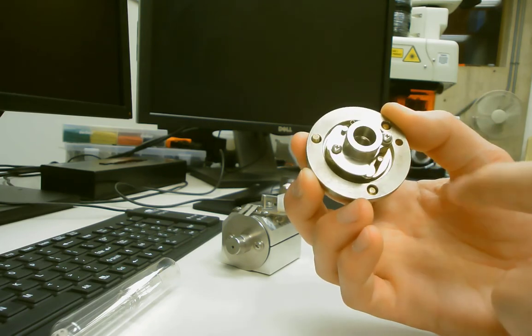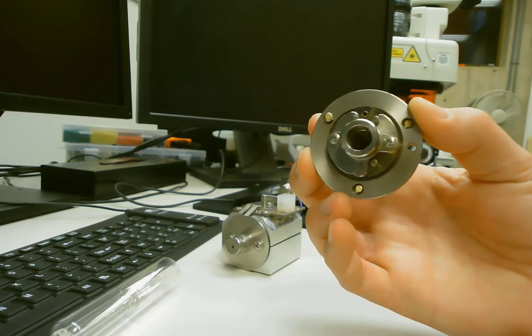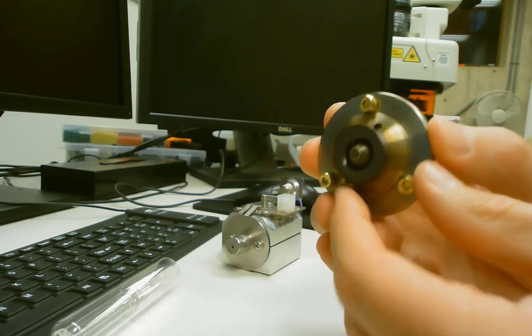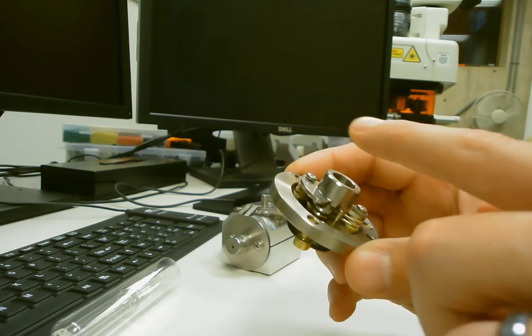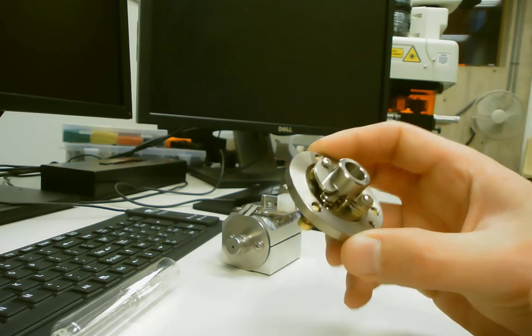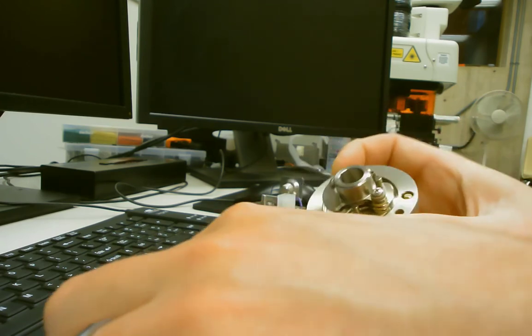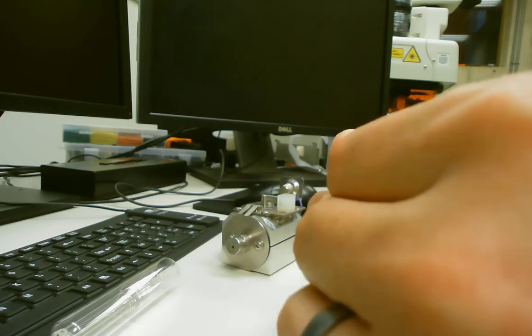There are little pins that touch each lens in a different spot and apply voltages. So there are focusing and accelerating lenses here, but in the real lens that's in use, there's a plate over the back with a hole in it that's offset by a couple millimeters from the main orifice, and that is to deflect the ion beam.